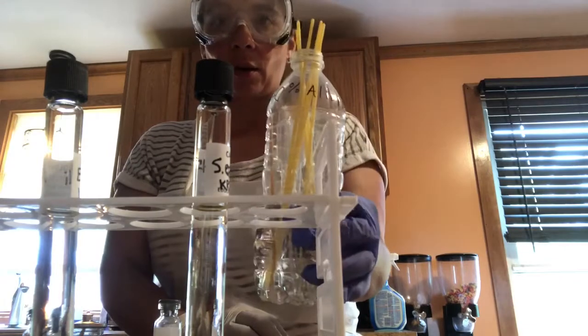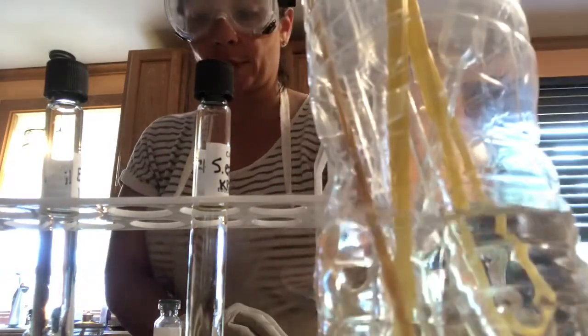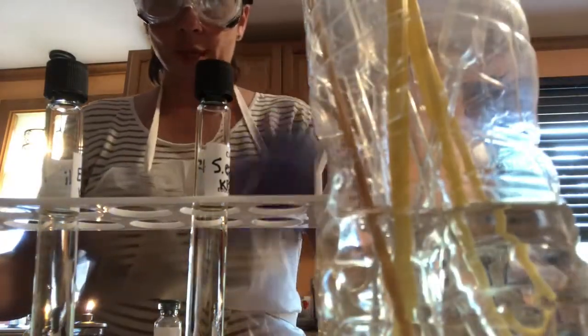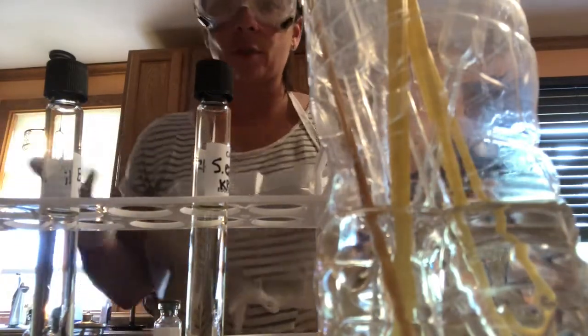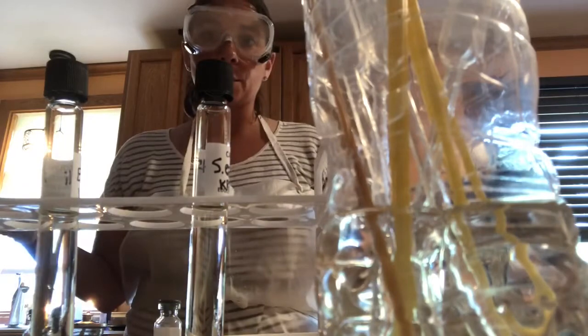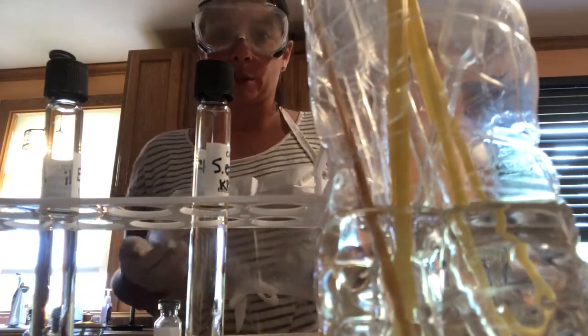Okay, I also want to make sure that I have handy, but not too close to the flame, my 70% alcohol disposal vessel. So when I'm done with the transfer pipette, I can throw it right in there. And again, you might want to put a paper towel or a paper plate down, just so when you're working with the bacteria, I know several of us have experienced this already. Sometimes it spills and you don't necessarily want it to spill in your kitchen.